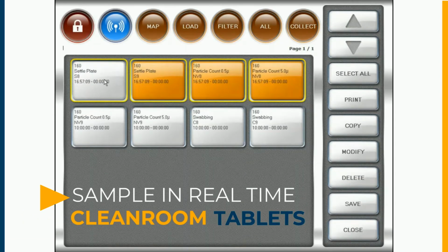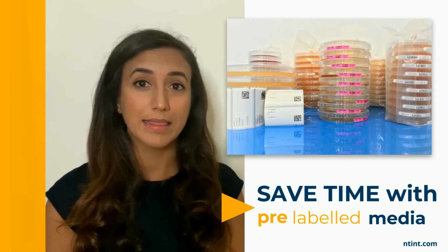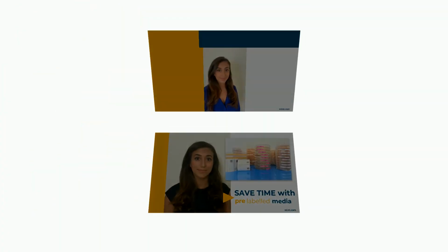Sample paperlessly in real time with our EM mobile-friendly Cleanroom tablet. We work with pre-labeled media to save you the time and effort required to print labels for your media.